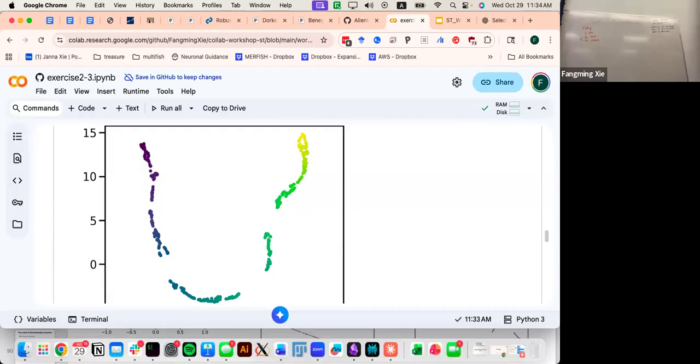It's just a selection problem. So this usually has two columns. Here I want to just select the first column and send it in here, and select the second column there. The syntax is a little weird actually.